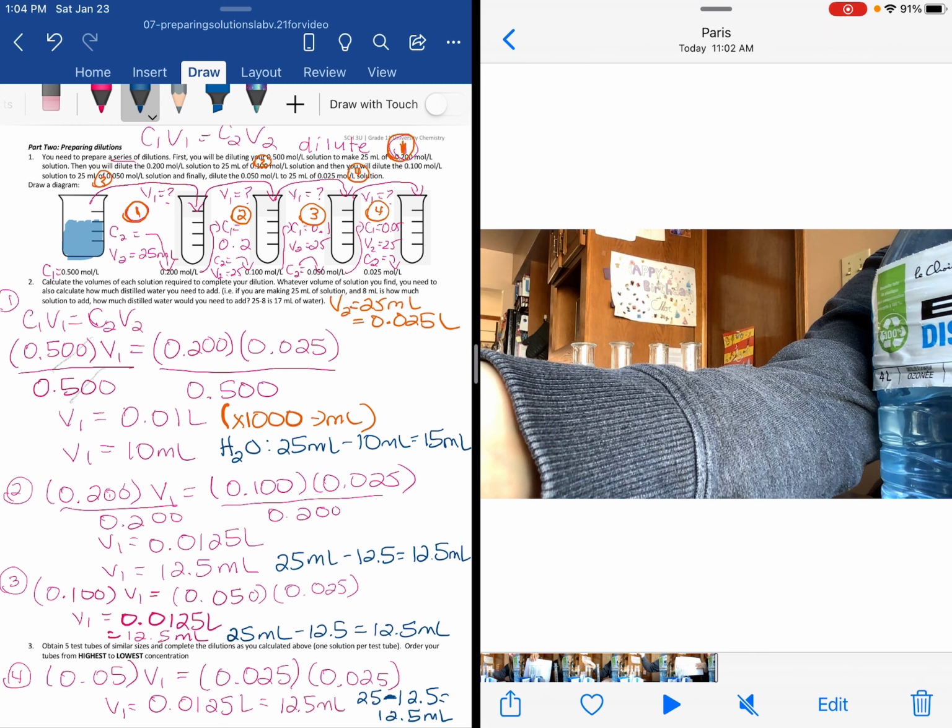So that's why I use the blue copper 2 sulfate pentahydrate, because it gives this nice color so that you can actually see the change in concentration. So normally, up until now in your chemistry lives, you've probably done more qualitative stuff, where now we're trying to switch to quantitative. And instead of saying blue is more concentrated, we're going to say 0.5 is more concentrated than 0.2. Okay, thank you.